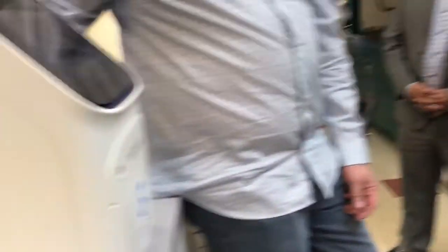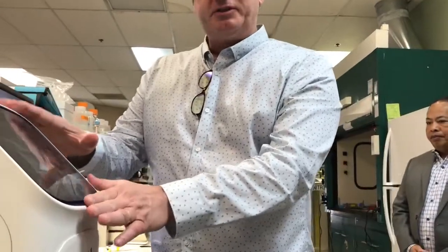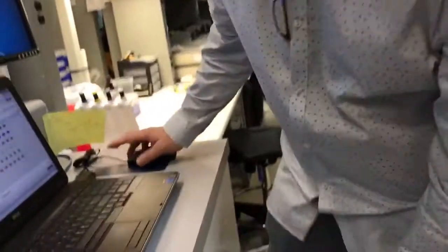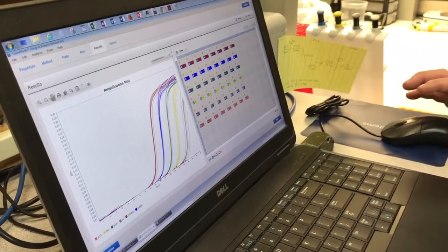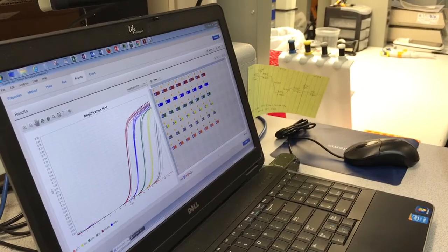This test, once it reaches this machine, it's about an hour and you get the results. This is called a thermal cycler, and the reason is because it heats and cools. Every time it heats and cools, it doubles the amount of material that was in the original. So you go from 10 copies to 20, 40, 80, 160, and eventually once you've gone through a certain number of doublings — what people call cycles — there's enough material to be detected by the probe. That's when you have to amplify it; there's just no other way to do it.